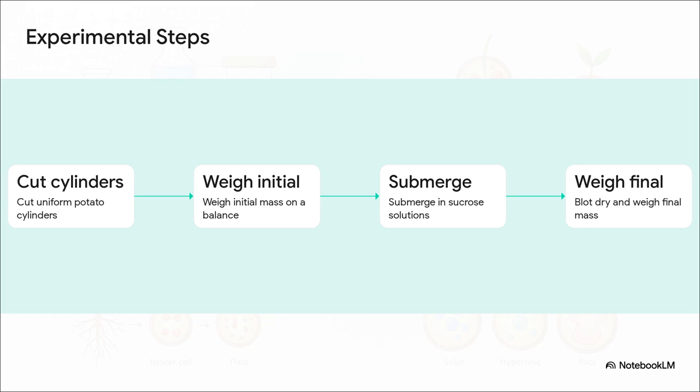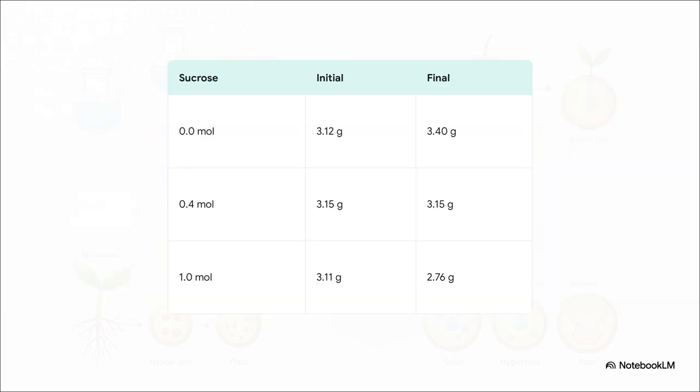So what do you think is going to happen to the potato in the pure water versus the one in the heavy sugar? Okay, the results are in.